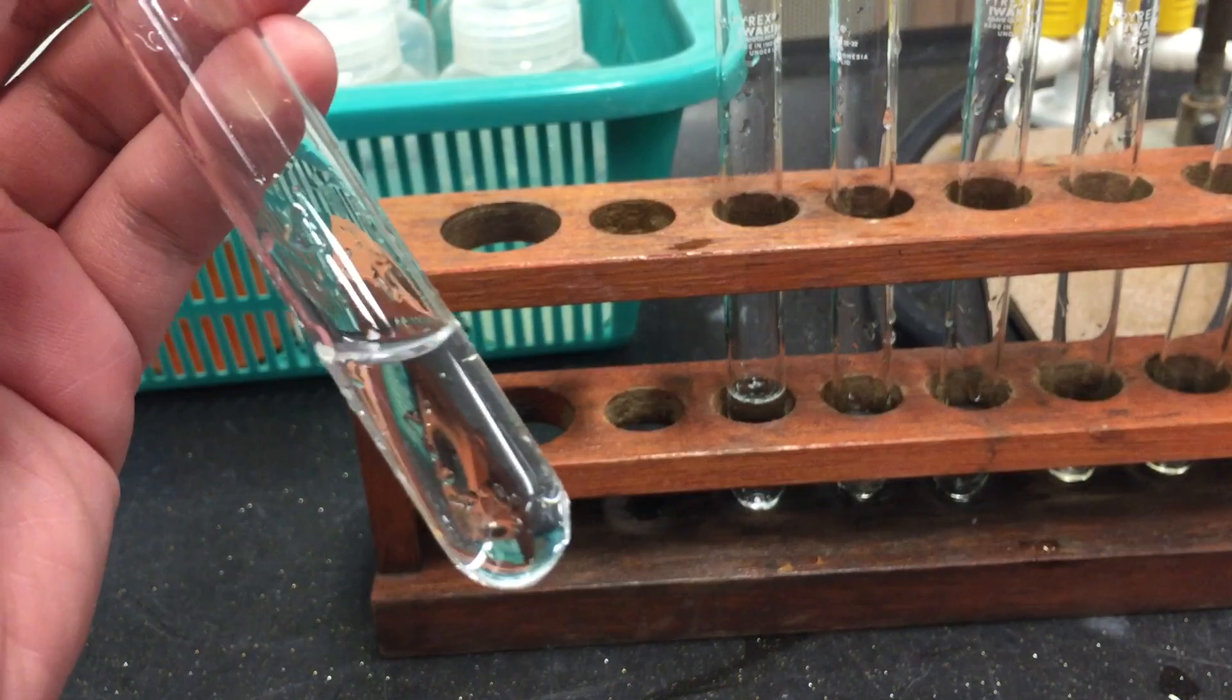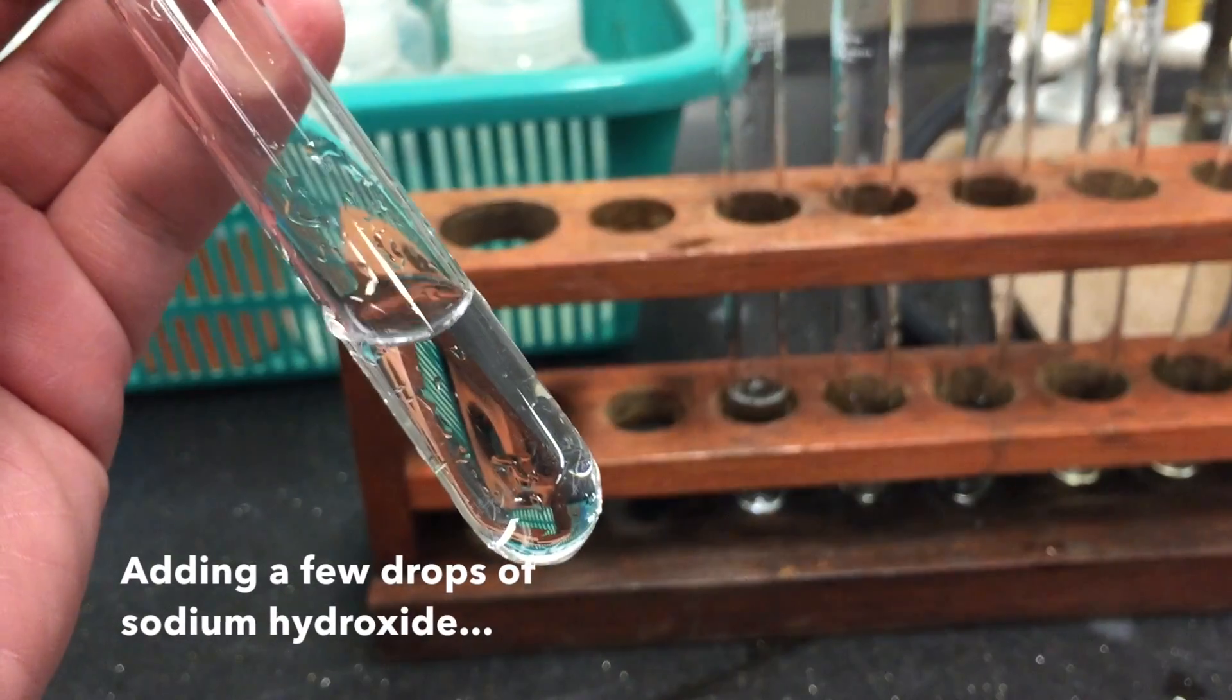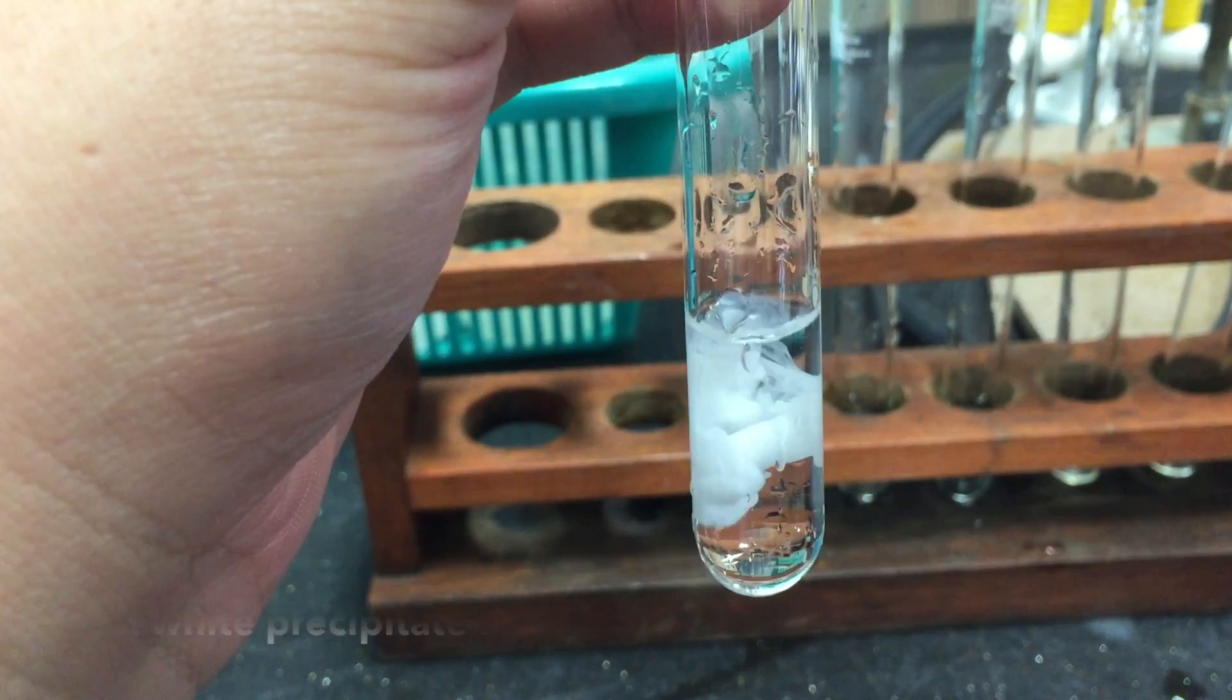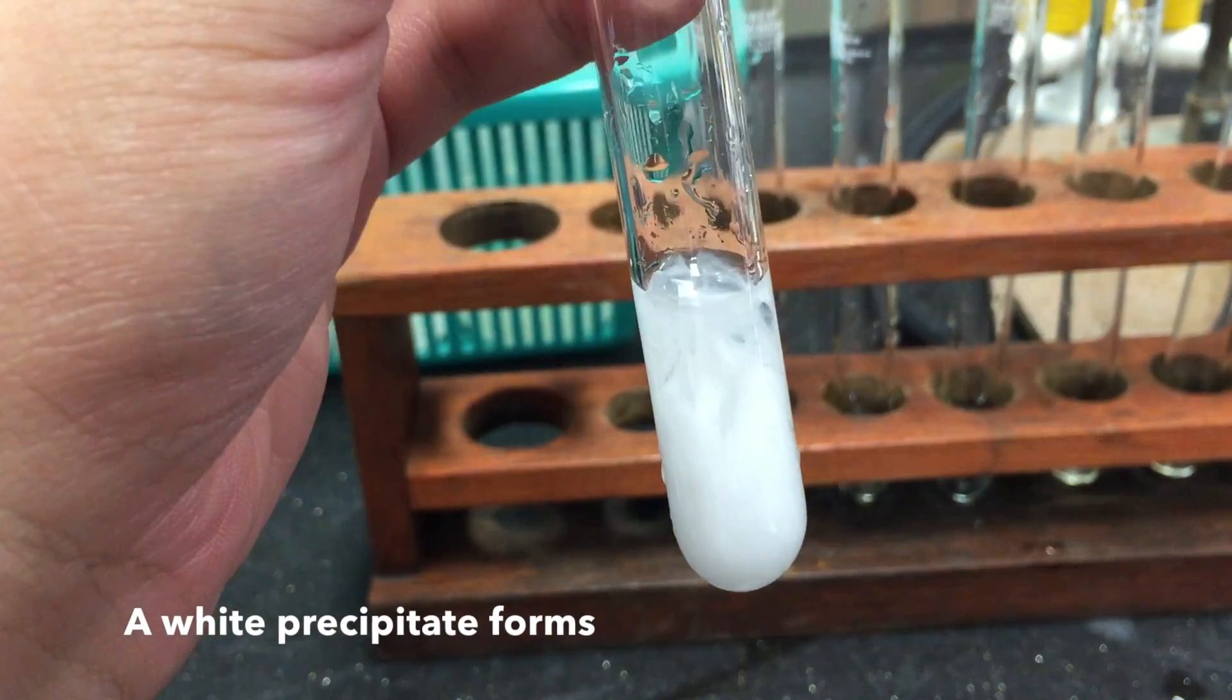To a small sample of your solution, add a few drops of sodium hydroxide. Immediately, a white precipitate forms.